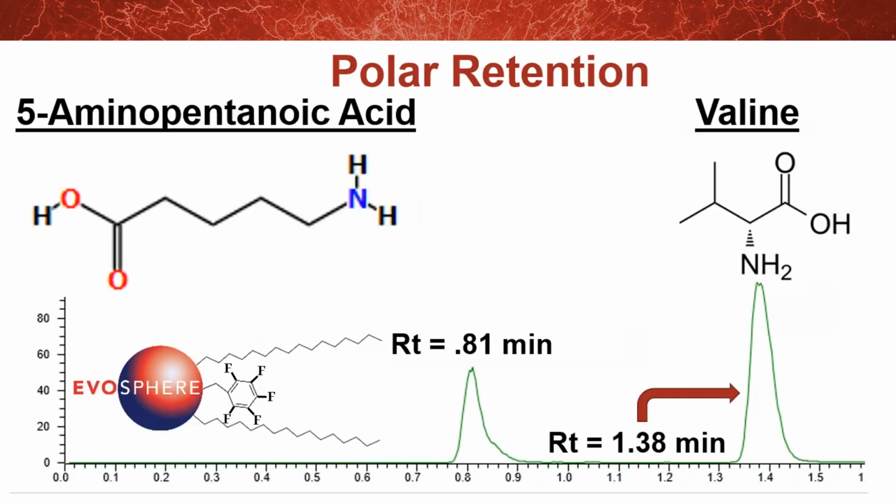The first thing here is showing for the monodisperse material, that surface area is coming in and driving, and also the selectivity, the bonded phase, is driving the retention of pretty polar compounds. So 5-aminopentanoic acid has a log P around negative 2.5. So normally in reverse phase, I mean, that's going to show up in your T naught.